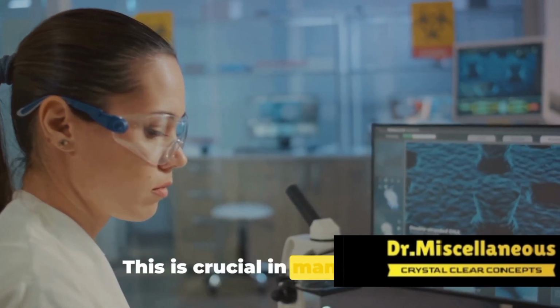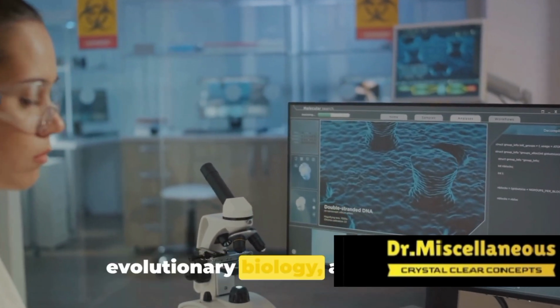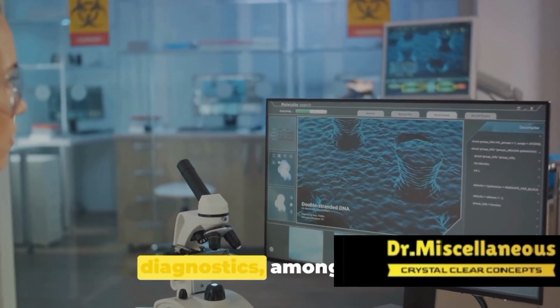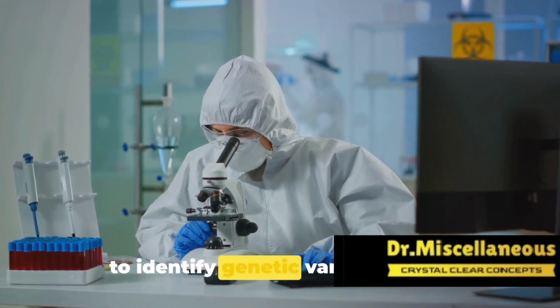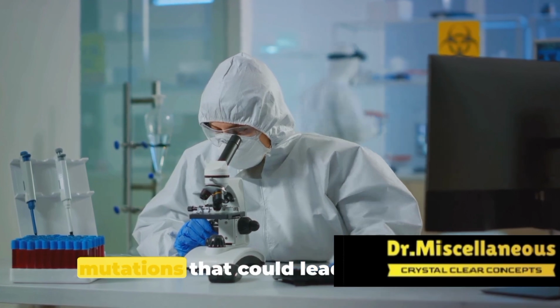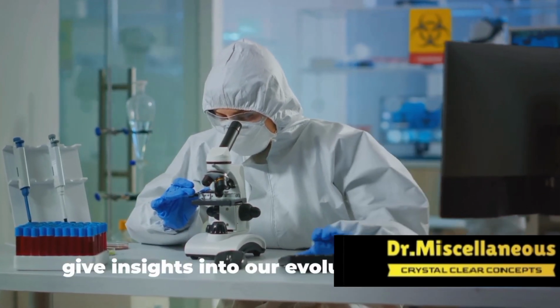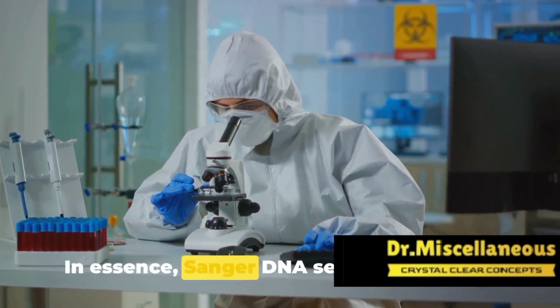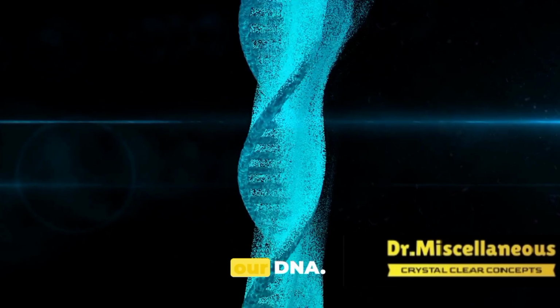This is crucial in many areas of biological research, including genomics, evolutionary biology, and medical diagnostics, among others. It's through this method that we're able to identify genetic variations and mutations that could lead to disease or give insights into our evolutionary history. In essence, Sanger DNA sequencing is the key to unlocking the secrets hidden within our DNA.